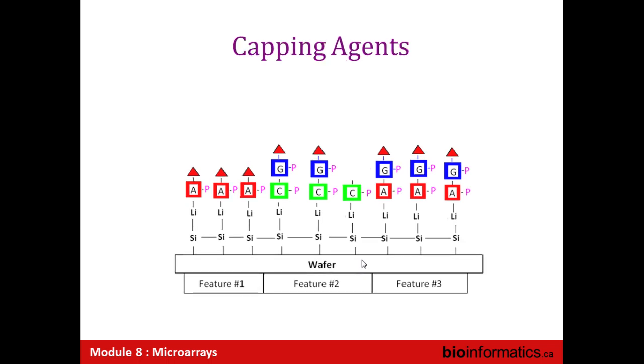And so it's entirely possible that in one run, there won't be an activated spot. Not by any fault of the experiment, but simply because kinetics works that way. It's always random chance probabilities that a reaction will go to a certain point. And sometimes it won't. The reaction won't go to completion.